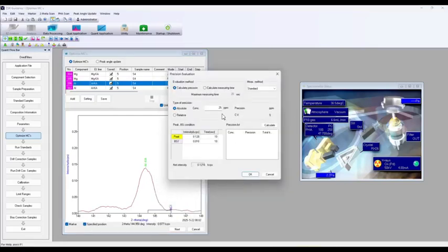which allows me, and it knows already when I ran that scan based on my standards, how many ppm of aluminum were in this sample. So it knows for this standard it was 25 ppm, it gives us this scan, and given a 10-second counting time for peak and background, I can calculate, and it tells me what my detection limit would be based on that scan. And so it says, okay, I would be about a 1 ppm or 0.9 ppm detection limit.